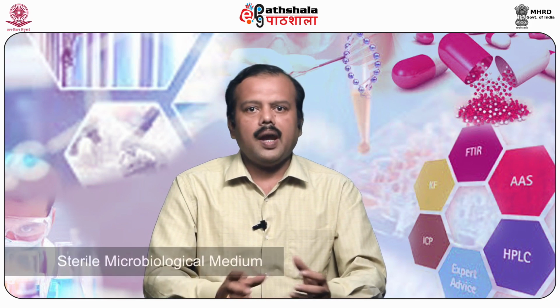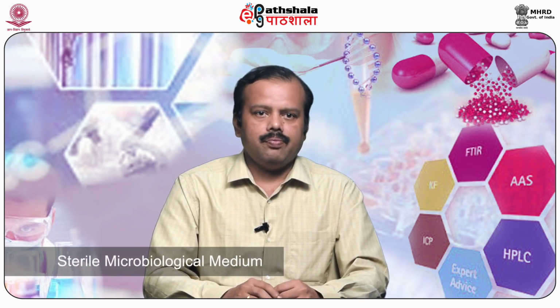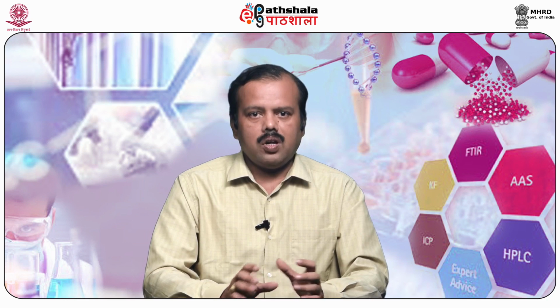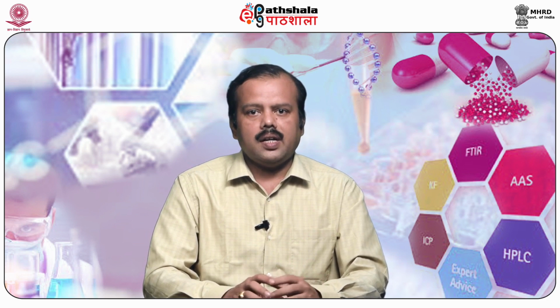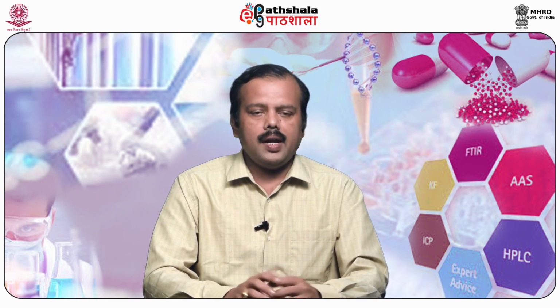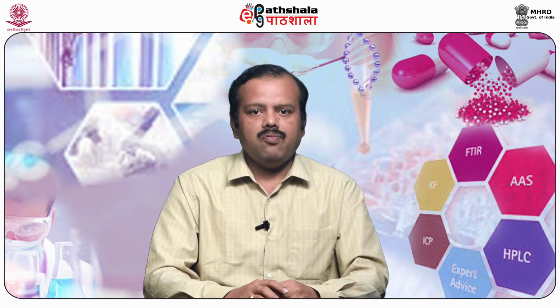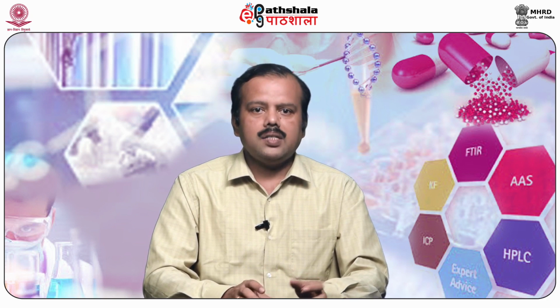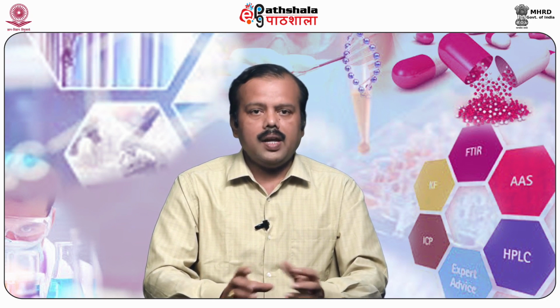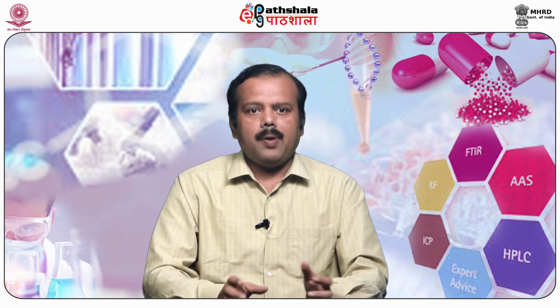Preparation of sterile microbiological medium. The steps involve accurate measurement of medium components. For solid medium, a solidifying agent, that is agar, is added, whereas for liquid medium, agar is not added. The solid culture medium is prepared in the form of slants or in petri dishes, whereas liquid medium is prepared in culture tubes for suspension culture.